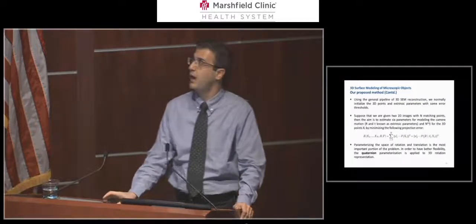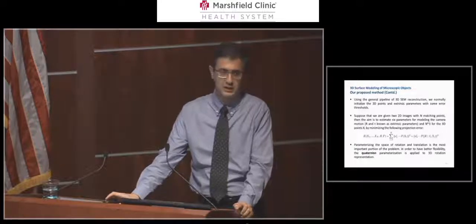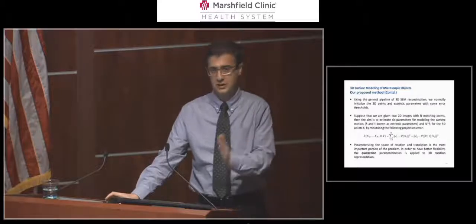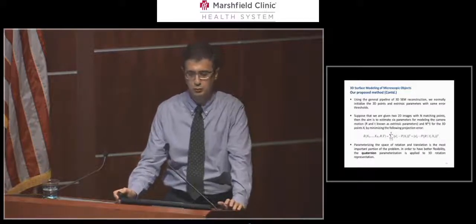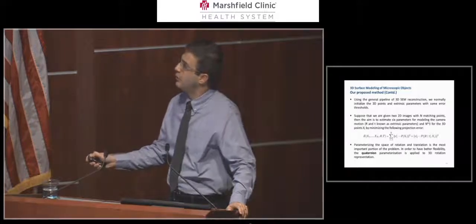Using the general pipeline of 3D SEM surface reconstruction, we normally initiate the 3D points and also rotation and translation with some error threshold. Suppose that we are given two-dimensional images with n matching points.